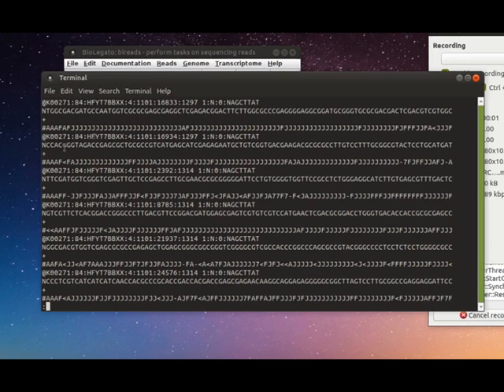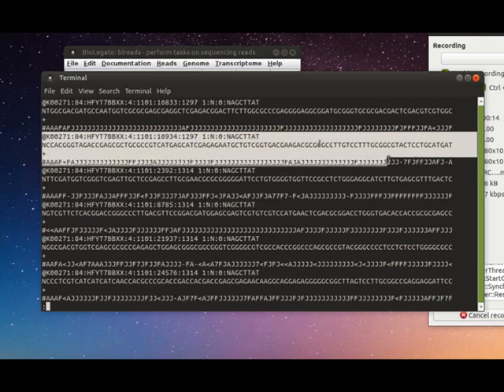So another thing that you can encounter at almost any step in working with sequencing reads is a file that contains some bad reads. This can happen for a number of reasons, but we're looking at a fastq file here, and all reads should be in 4 lines. A name line beginning with an @ sign, the actual sequence, another name line, and then the quality values represented as letters of the alphabet. So if anything doesn't match this formula for a read, it will be removed from the file.